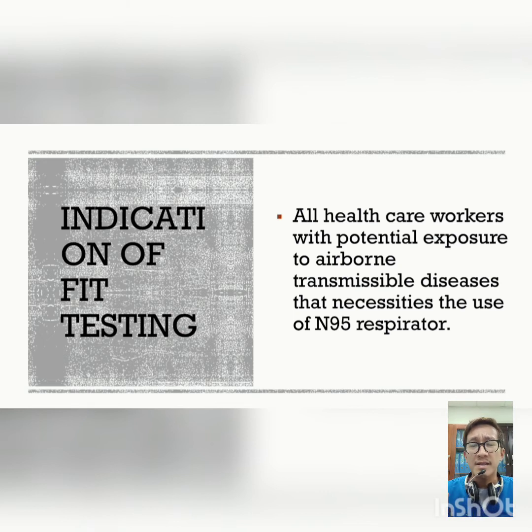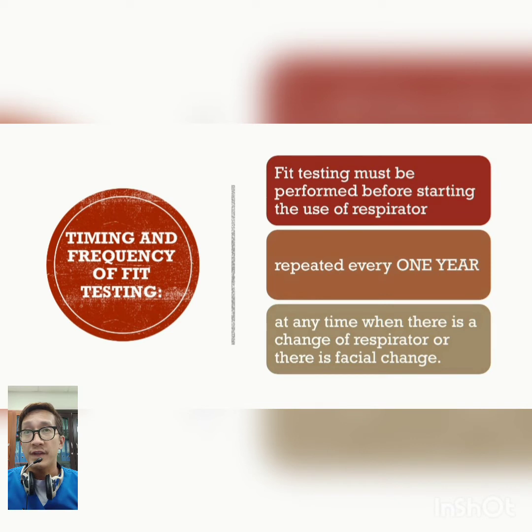The main reason why we do fit tests is for us to be able to identify the correct type and model of N95 mask that fits us. We have different types and models of N95 mask, and not all of them fit us. So we need to do fit testing so that we can easily identify which among these N95 masks will suit us.